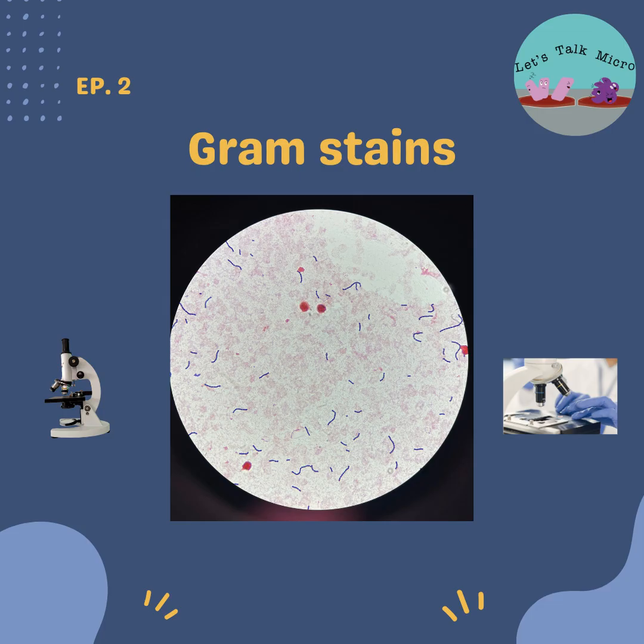In addition, it also provides important clues as to whether you have a good quality sample or not. And this is very true with the sputums. All of you clinical microbiologists out there, you know that you have some guidelines in the lab, depending on the ratio of epithelial cells versus white blood cells. I'm going to talk more about this on the next episode. If you have greater than 10 epithelial cells, you will reject your sample.